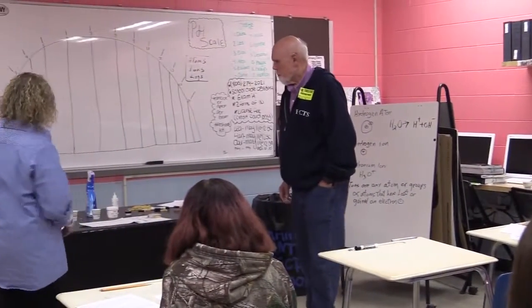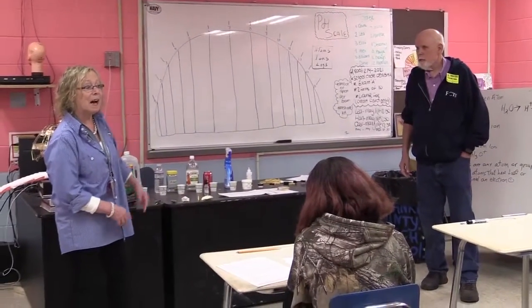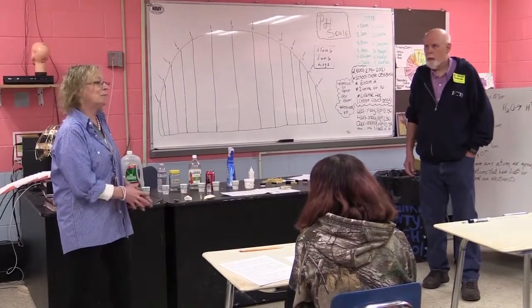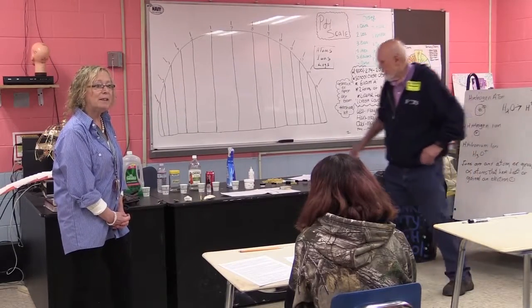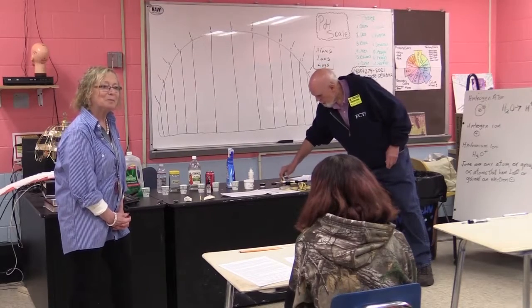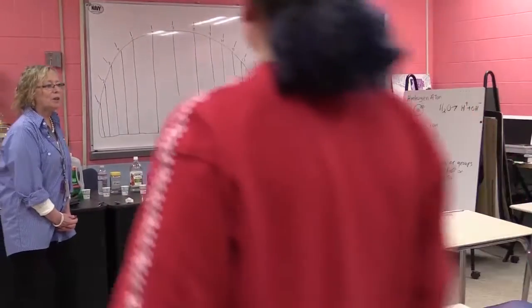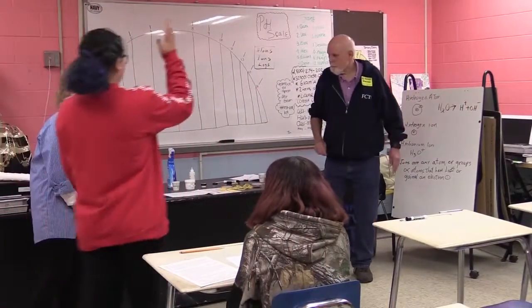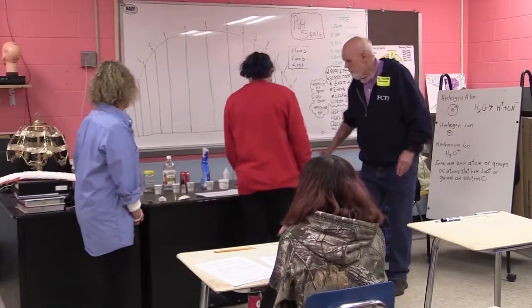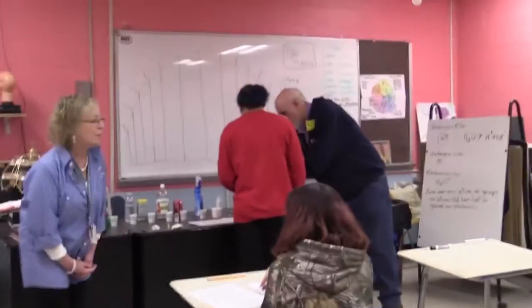Any guesses on any of the items up here? What do you think Coca-Cola would be? A 9? All right, why don't you come up and see? Grab a paper, let's see what it is. A 9, Renee? Go ahead, come on up, please. How many of you guys drink Coca-Cola? All right, let's see what the pH is. Let's see what it's doing. Just dip it in, and compare it with the scale.